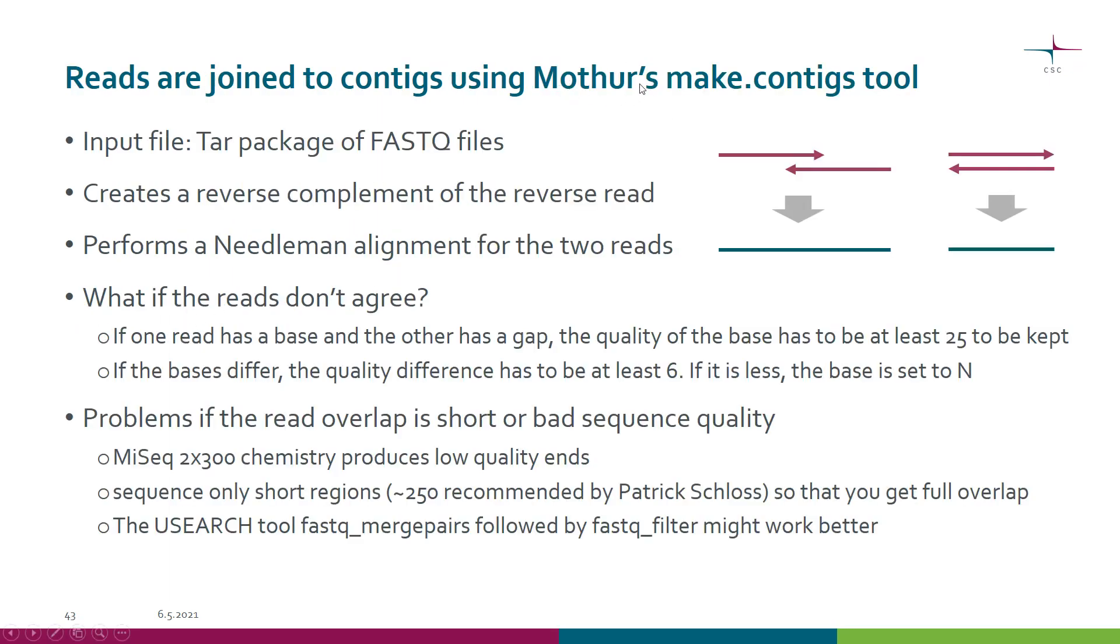Chipster uses the Mothur package for this step, as for many other steps in microbial community analysis. Here it's the Mothur tool make.contigs.